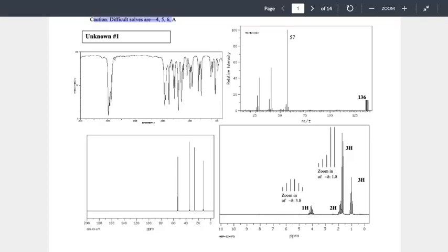We've got 4 spectra. Where should we start our analysis? Why do we want to start with the IR? Lovely answer for someone that hasn't taken my class before. I appreciate that answer. All right. It'll tell us the bonds that are present. Why does that matter?